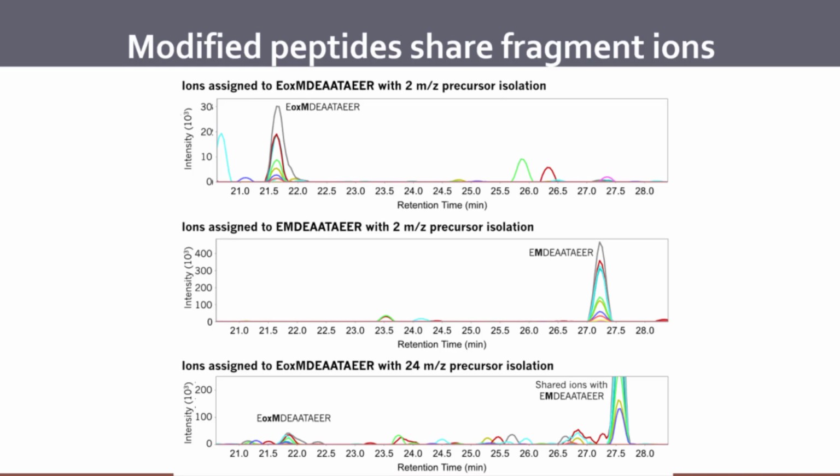And now, because these on-column libraries have the retention time measured very specifically on that column in that sample matrix, the retention time is known very well. So that gives us a lot of extra power. Something like oxidation does cause a big shift. You just have to be careful going with a spectral library directly to a wide window piece of data.